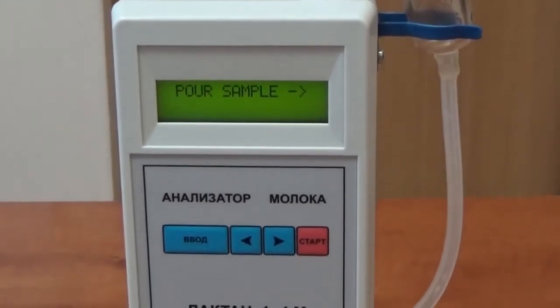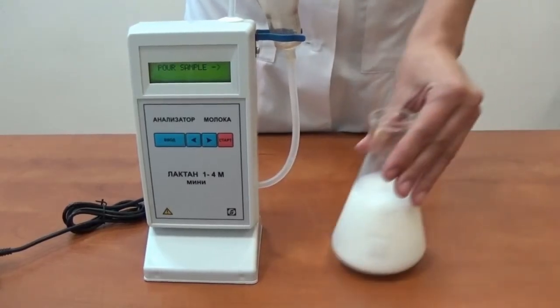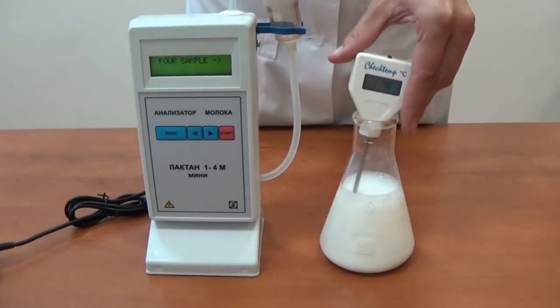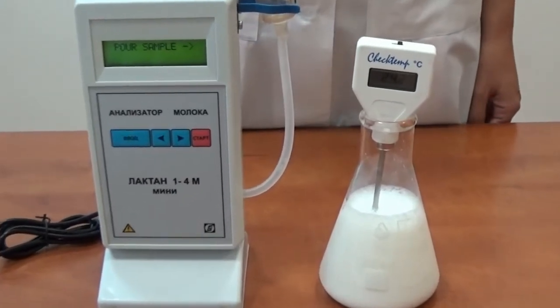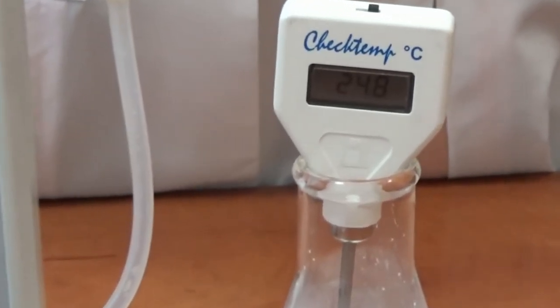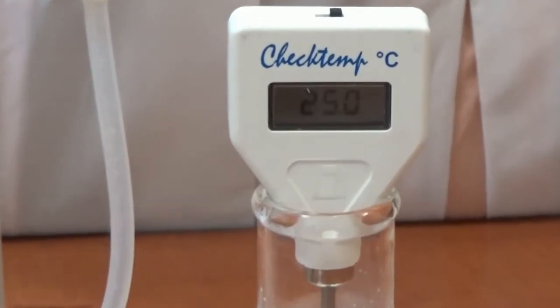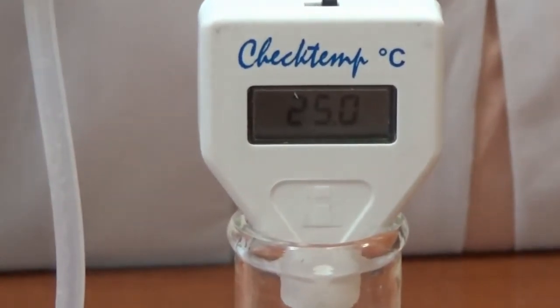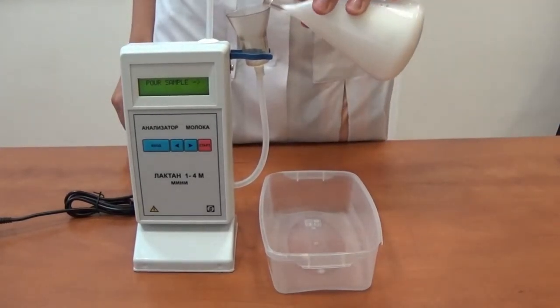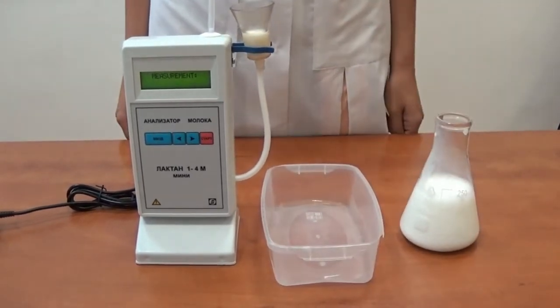When warming up is completed, the message 'For sample' will appear on the display — the analyzer is ready for operation. If the milk sample was cooled, we recommend heating the sample in a water bath to a temperature of 40–45 degrees centigrade, then stirring it and cooling down to 25 ± 2 degrees centigrade and mixing again. We recommend using a milk sample at a temperature of plus 25 degrees centigrade.